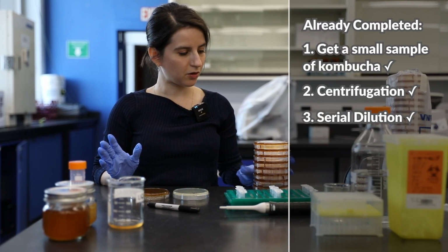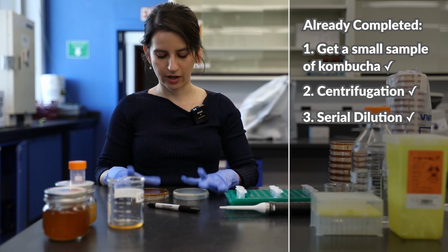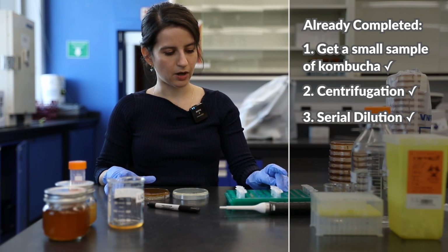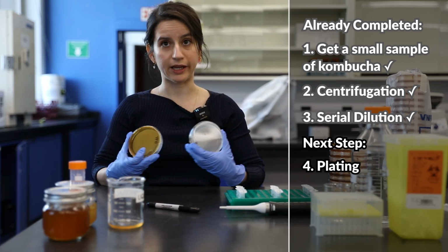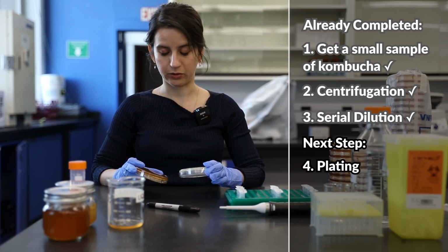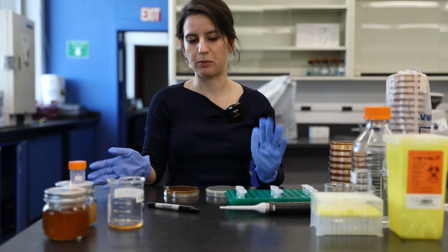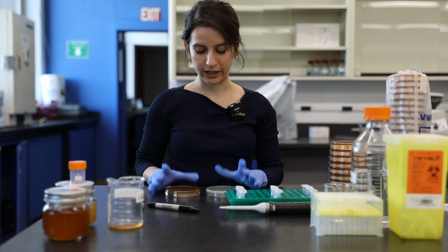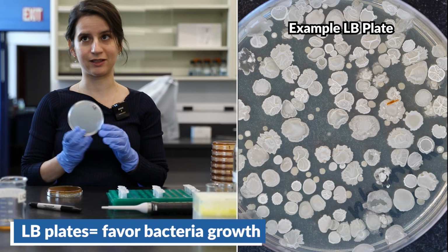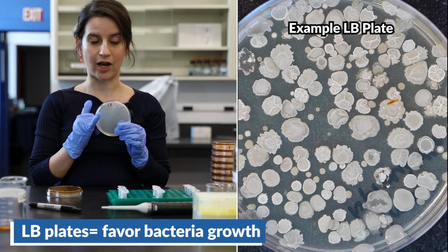Okay, so now we've done our serial dilutions and we're ready to isolate single colonies. To do that, we first need to plate our serial dilutions. When we think of a kombucha mixture, there's both bacteria and yeast. And we need plates that have the nutrients that the bacteria need to grow, for which we use these LB plates.